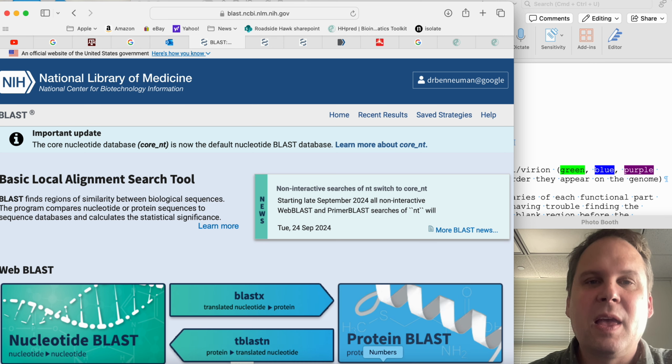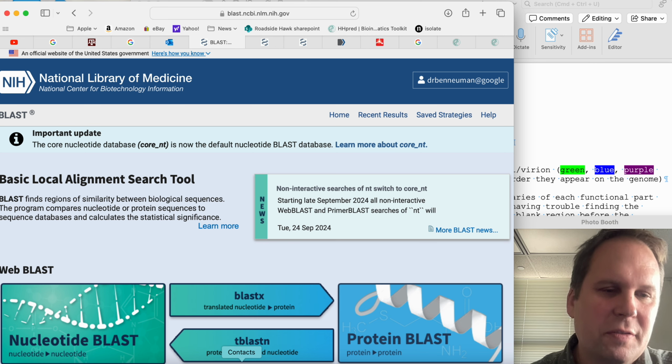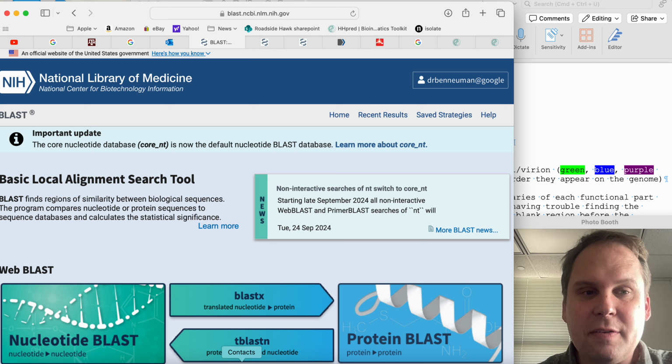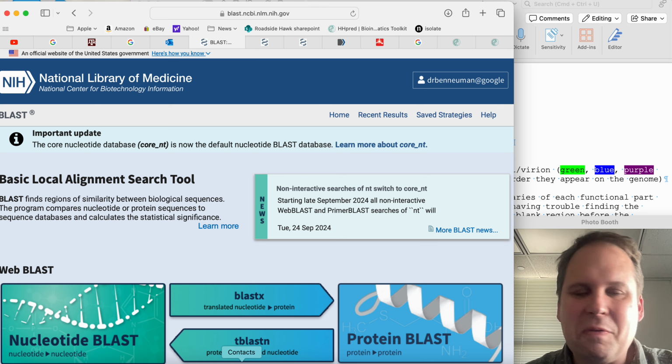All right, so the tools we're going to use are going to be BLAST. Now, BLAST, remember, is a search engine that can search nucleotides or search proteins, and it can search nucleotides with proteins, proteins with nucleotides, because you can translate any nucleotide sequence and figure out what protein it could make. And so you can search against theoretical proteins, proteins that should exist. Basically, what we're searching is GenBank. It's all the sequences that humankind has recorded since the dawn of molecular biology, not time.